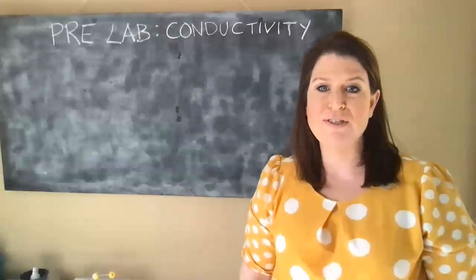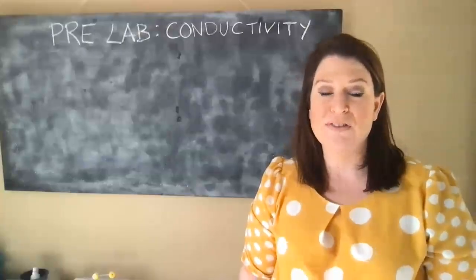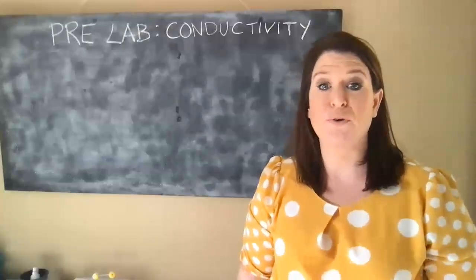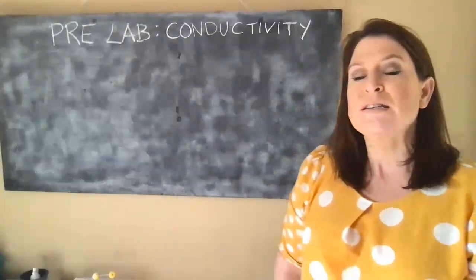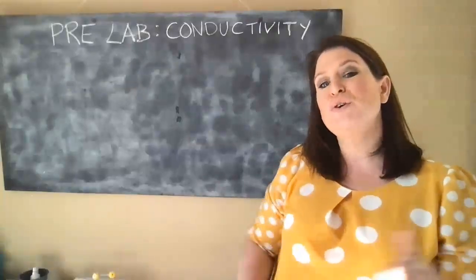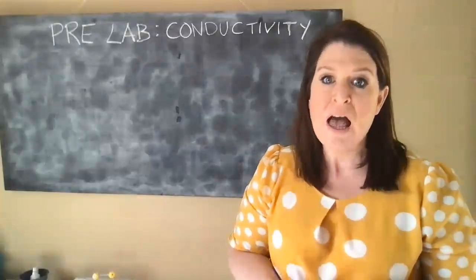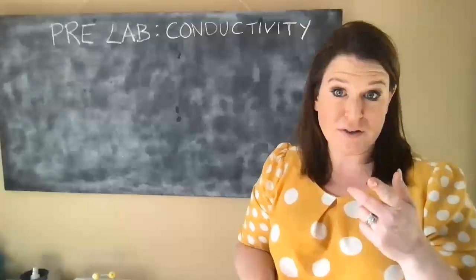Hi everyone, welcome to this pre-lab talk on the conductivity experiment as part of the CH202 module for second year analytical chemistry. So this experiment is really two different major components, and both will be concerning conductivity.